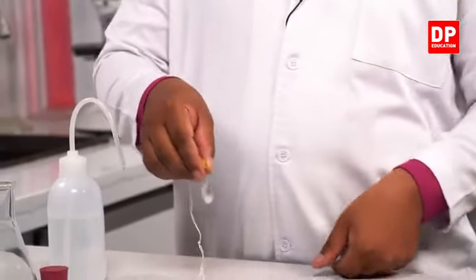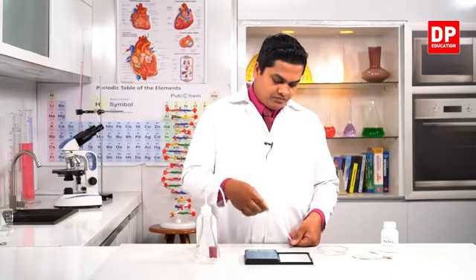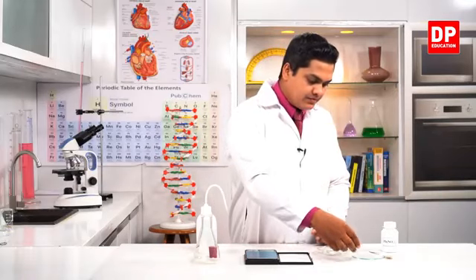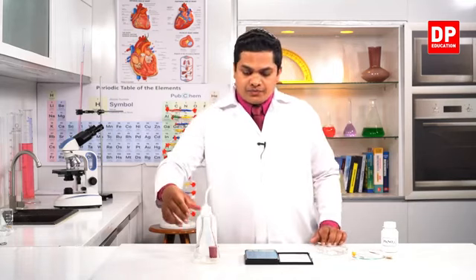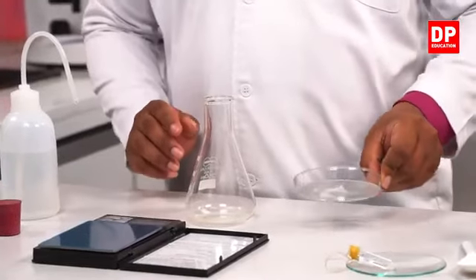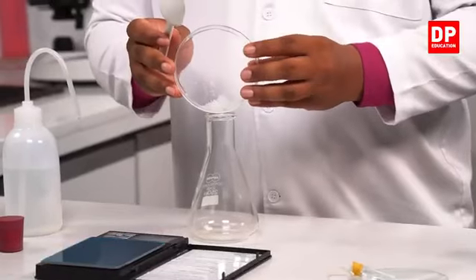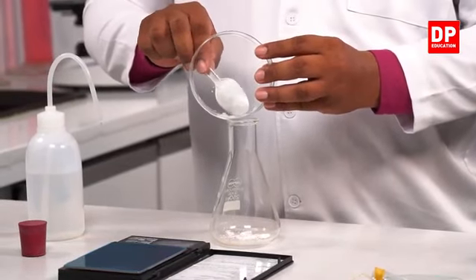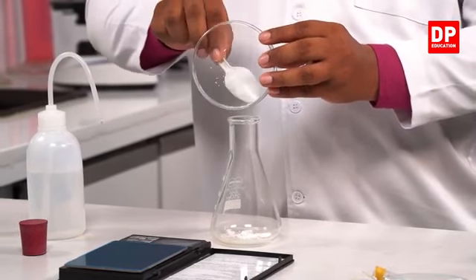I'll shake and dissolve the sodium chloride in the ignition tube. Right, now by using another flask, I'm going to add some lead nitrate into it. I will use this spoon to get the lead nitrate into the flask. Now let's add some water and make a solution.